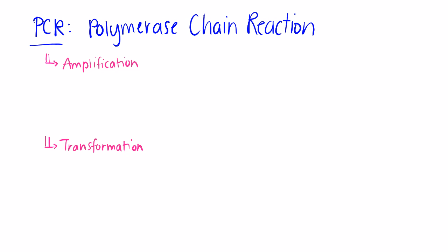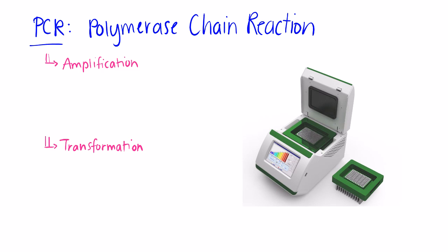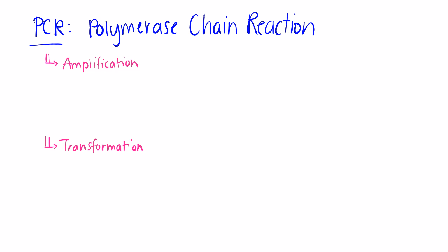Hi everyone, today's video is on polymerase chain reactions, or PCR. This is what a PCR looks like, but this picture doesn't do you much good until you know some words. Key terms like amplification and transformation.